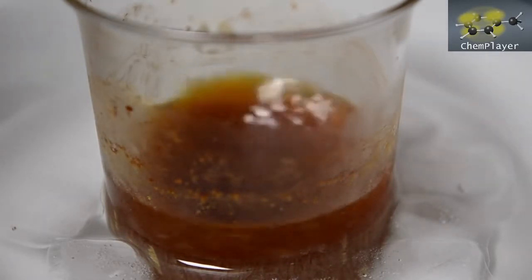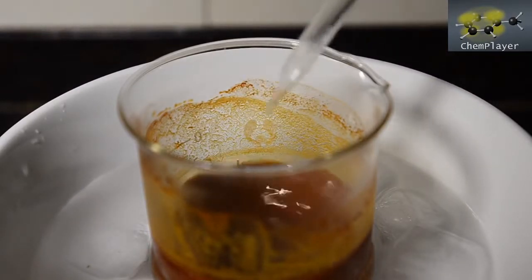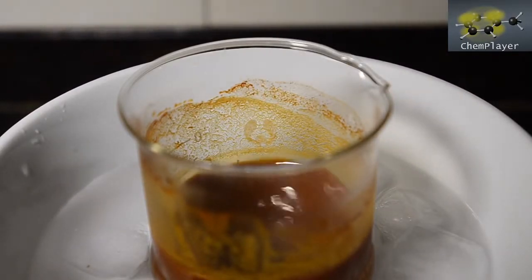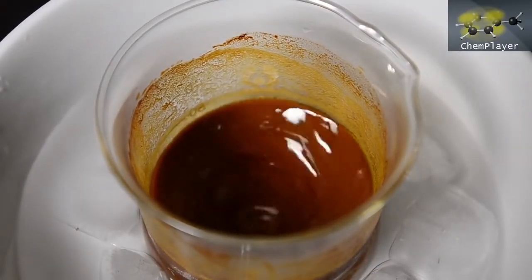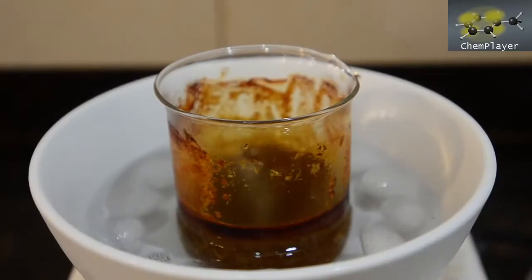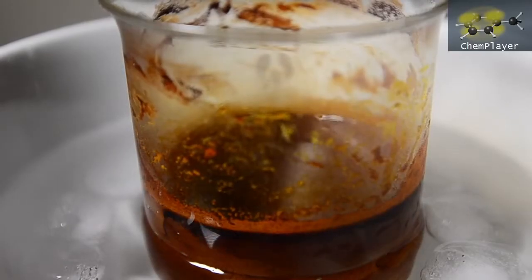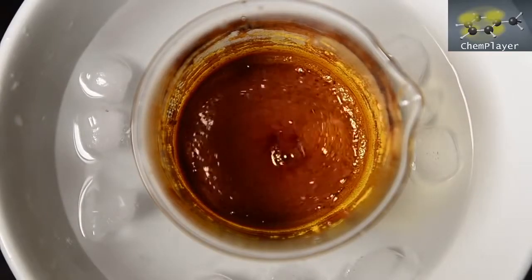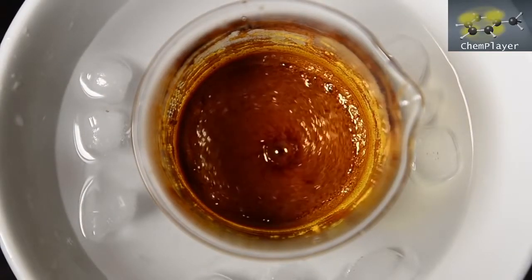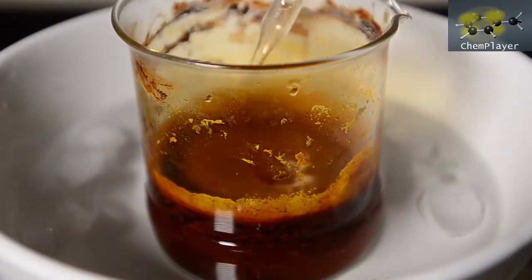Soon we've got a yellow-orange colored precipitate forming, and the mixture is a red color. The temperature is under control, but we notice that if we add more than a few drops of acid at one time, there's a slight bubbling of the reaction mixture. We left a few ml of the nitric acid behind, probably adding about 16 to 17 ml in total. Towards the end we couldn't see any more exotherm, and there was a tiny amount of brown nitrogen dioxide gas being produced.